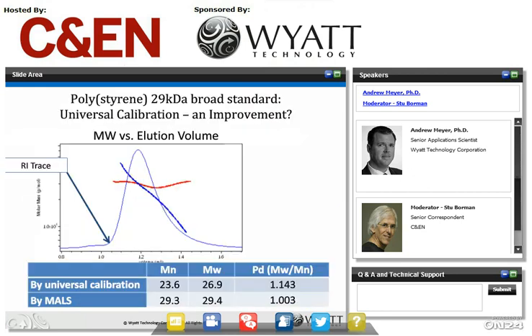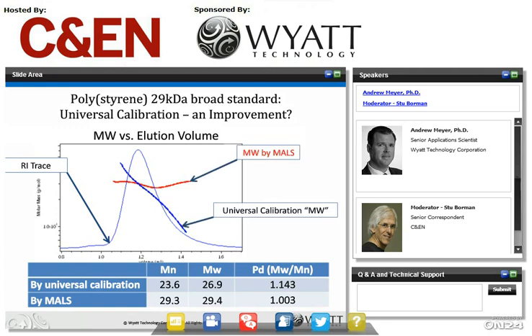Moving on, we have the question of universal calibration. At least one or two of you might be thinking: can't we use a viscometer to improve on the column calibration and instead go to a universal calibration regime? Maybe all these problems go away. So let's involve a viscometer as well and see how much it helps. Here's an example of a universal calibration scenario where we plot the product of molar mass times viscosity versus elution volume. It's proposed that we can apply this to any random coil polymers — hence the name universal. We struggle when we compare the universal calibration-derived results with the absolute molar mass results from the MALS.